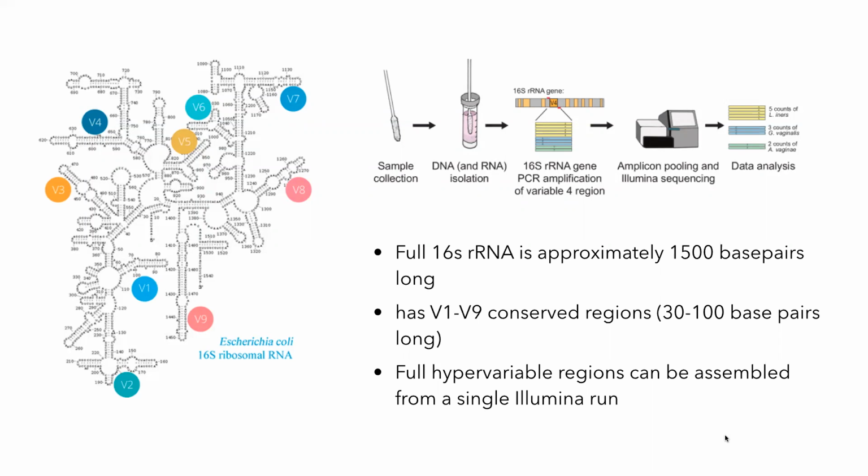Okay, some more questions. In the slide, I can see at the third step, it is written PCR amplification of V4 region. What is the significance of V4 over others? So the V4 region is actually one of the more conserved ones. So we can use that region to place our characterization of the sample composition within a certain level of taxonomy.